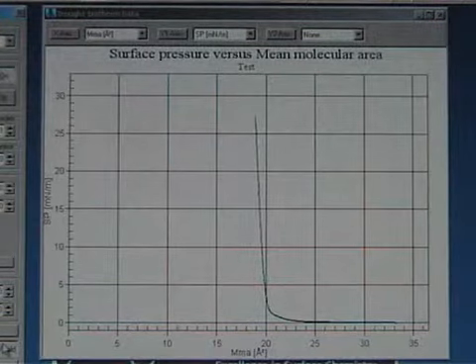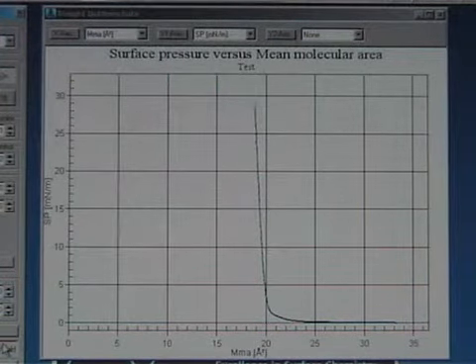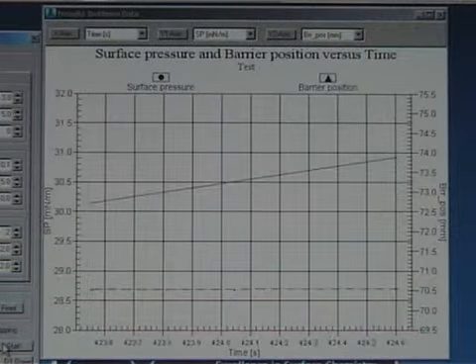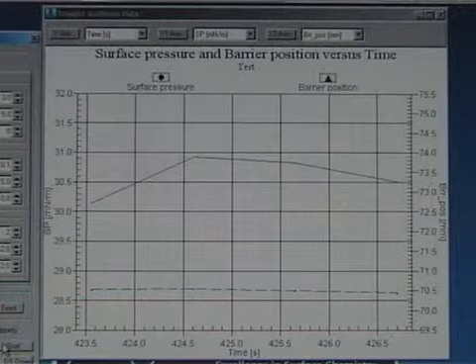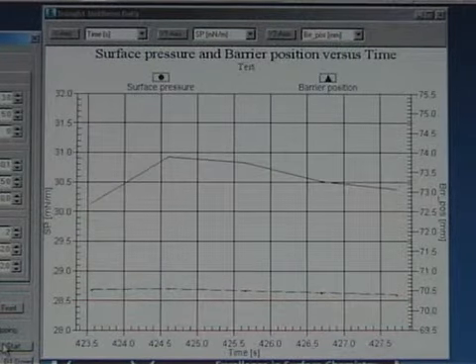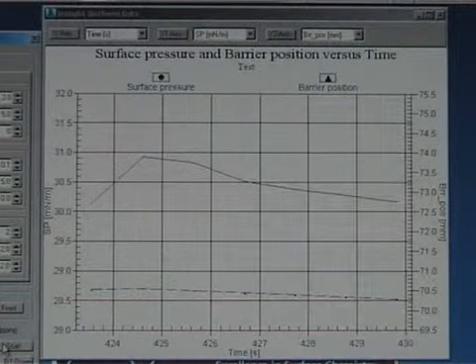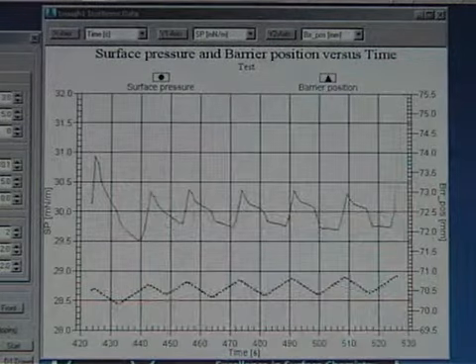Once the desired surface pressure has been reached, a new graph will replace the isotherm graph. Now it shows the surface pressure and barrier position against time. While waiting for the layer to stabilize, fill in the dipping method parameters.